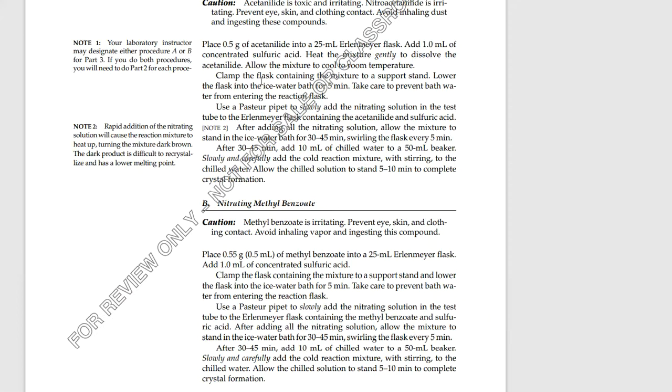All right, so it says, let's read together. Clamp the flask containing the mixture to a support stand. Lower the flask in an ice water bath for 5 minutes. Use a Pasteur pipette. Slowly add the nitrating solution in the test tube to the Erlenmeyer flask containing your compound. And then after you add the nitrating solution, you allow the mixture to stand for 30 to 45 minutes.